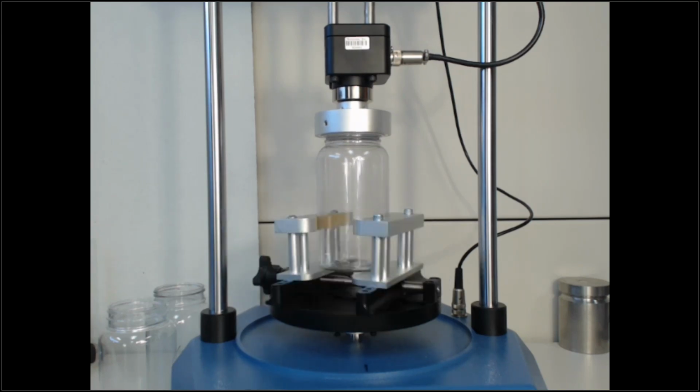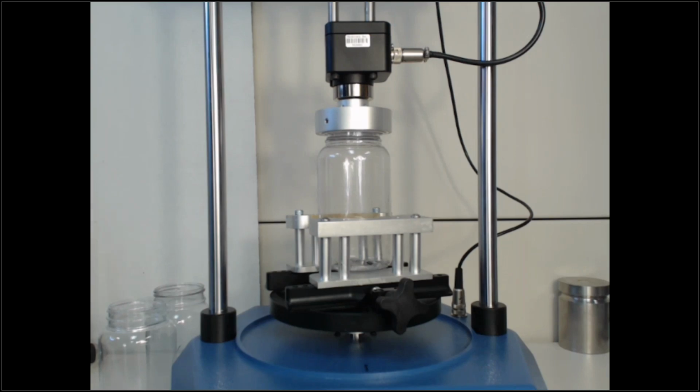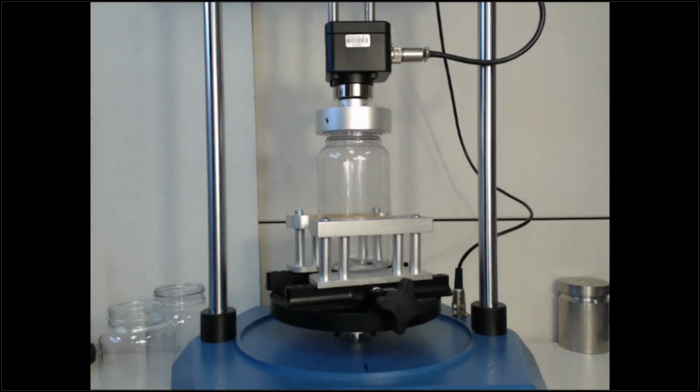Once again, as you can see, the cap is rising, and if you want to check at the end of the test to make sure that it is really open, you can technically just lift, and as you can see, it has removed the cap. So if you had a batch of 20 tests and 18 of them are opening every single time with that known axial force and running to that same angle, you know you're on your way to establishing a consistent and repeatable testing environment. If only 2 are passing, then you know you have a problem. So I always look at the 80 and the 20%, one way or the other. So this is what the actual test looks like.